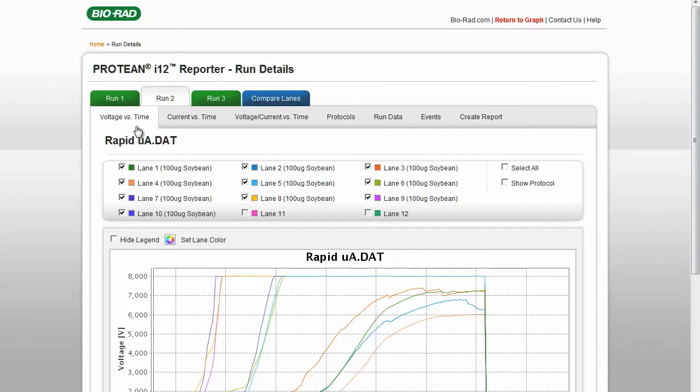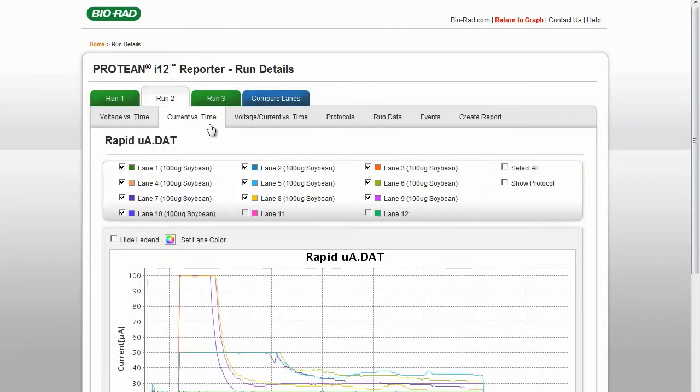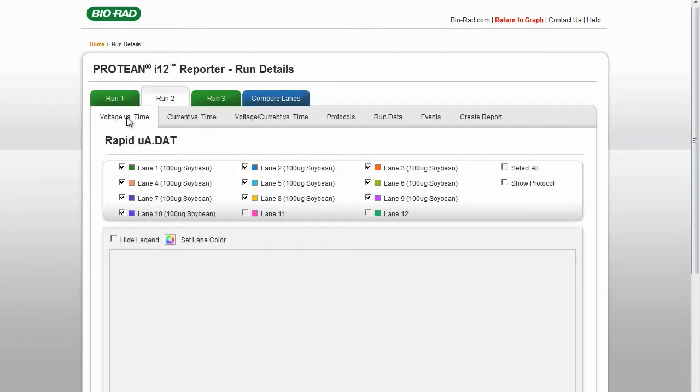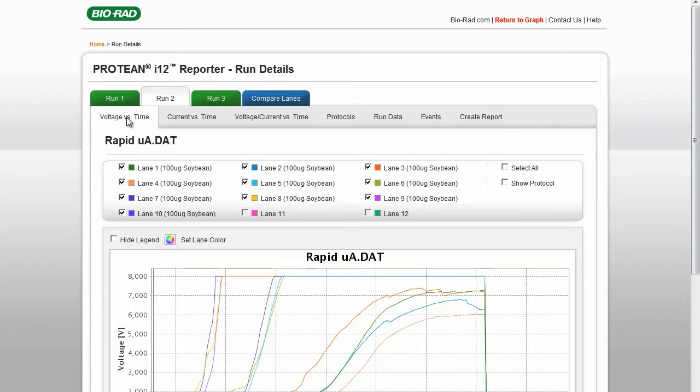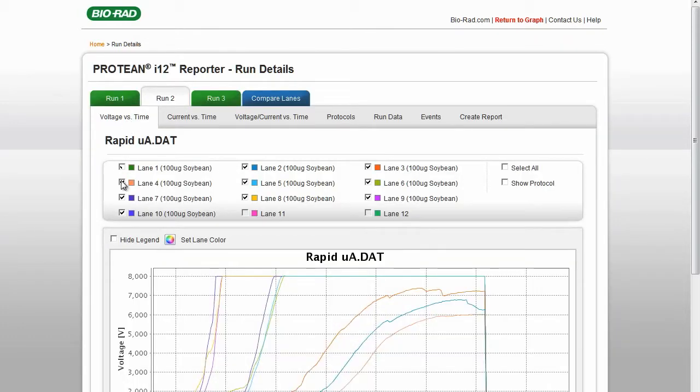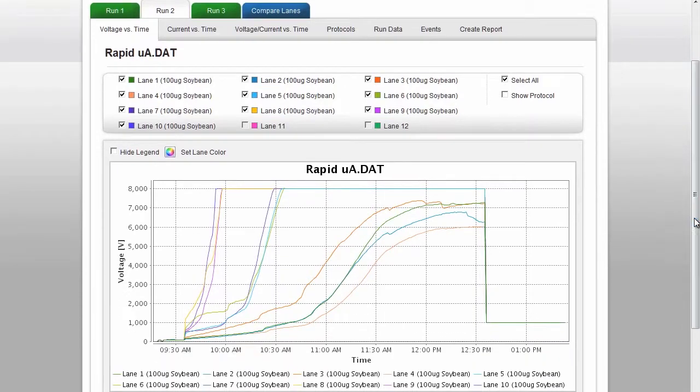There are three graph options you can select: Voltage versus Time, Current versus Time, and Current Voltage versus Time. You can click the boxes at the top of the graph to select or deselect certain lanes. Clicking Select All will select all lanes in a run. Unclicking Select All will deselect all lanes.